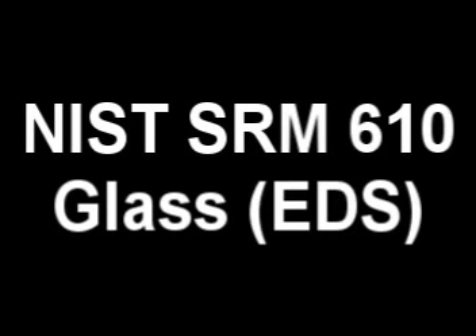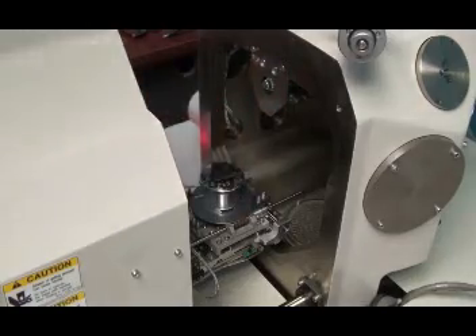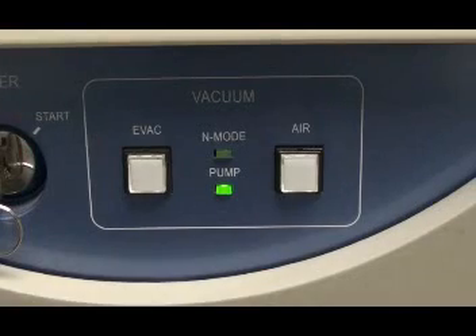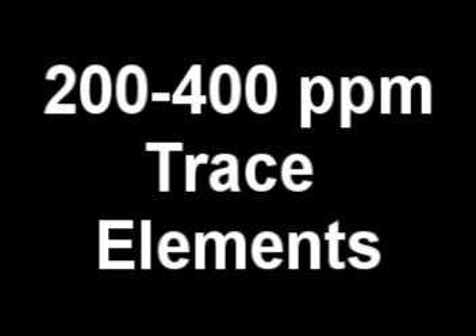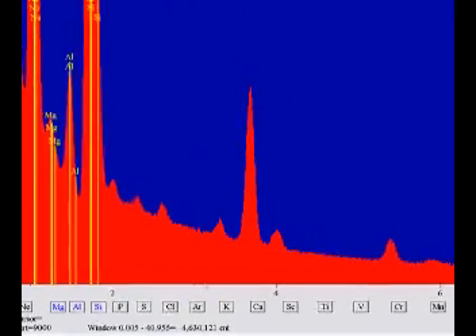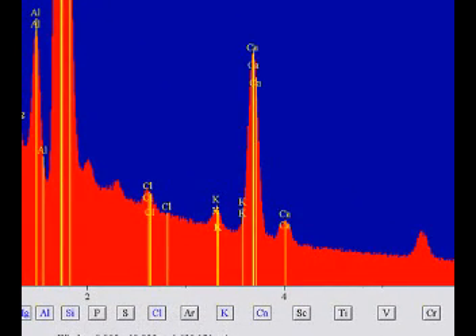This is a trace 610 glass by NIST. The sample goes in the chamber, the SEM is pumped down, and KV is turned on. These are 200 to 400 ppm trace element spikes. Here's the EDS analysis — large background, trace peaks. The key to XRF is very low background.